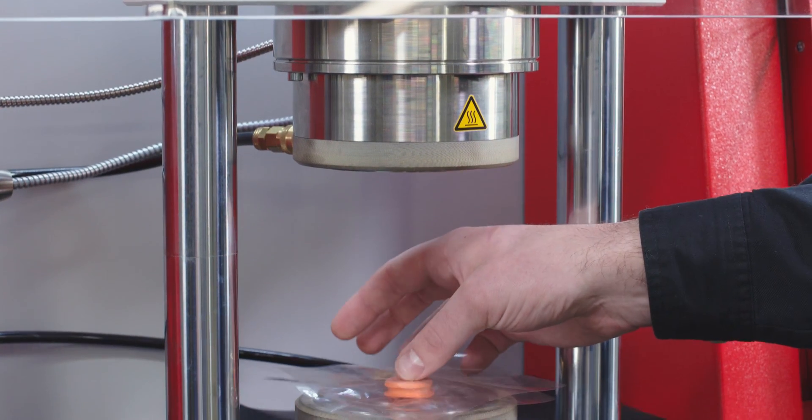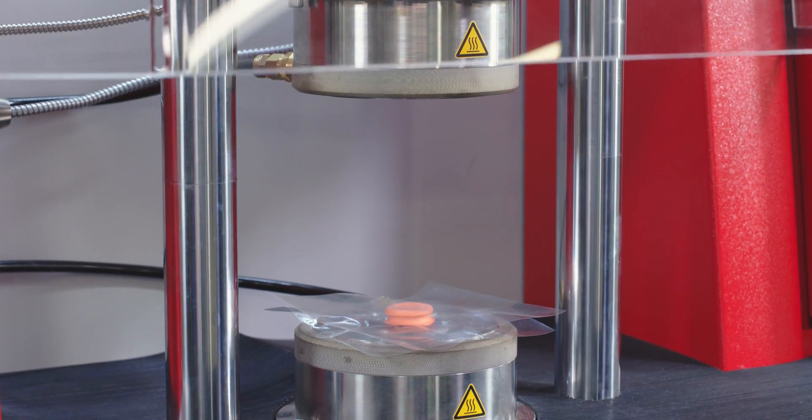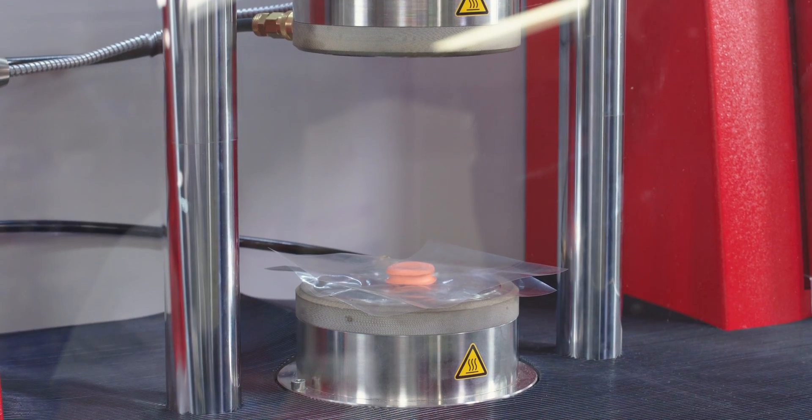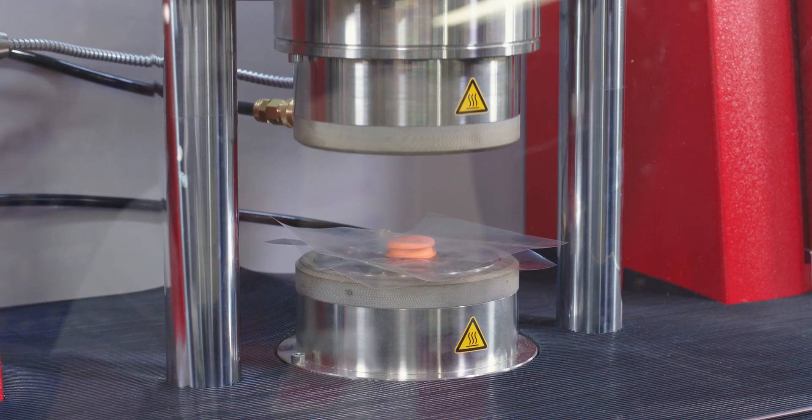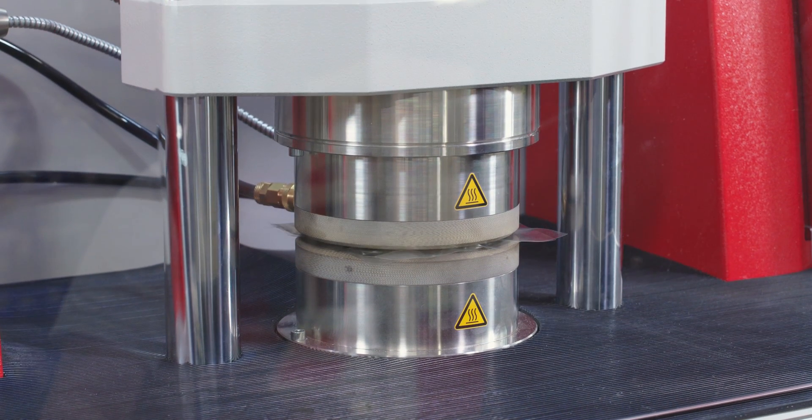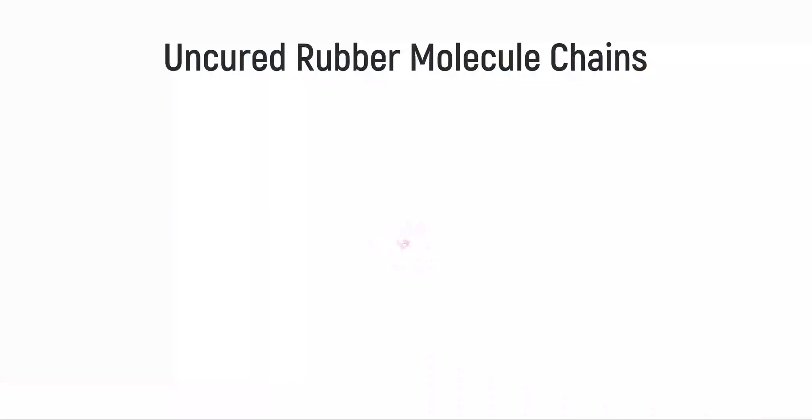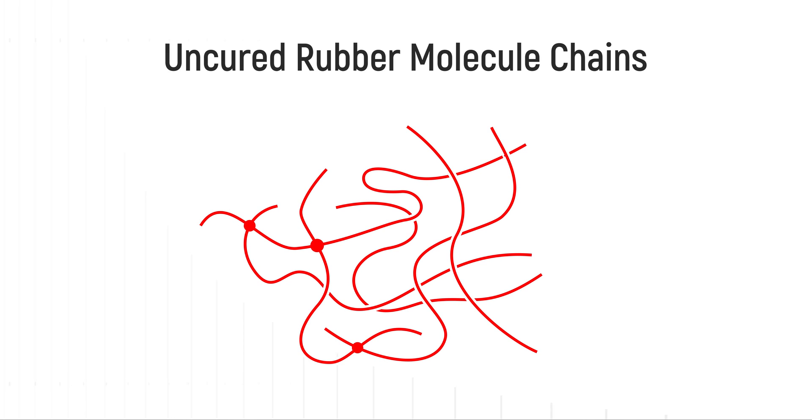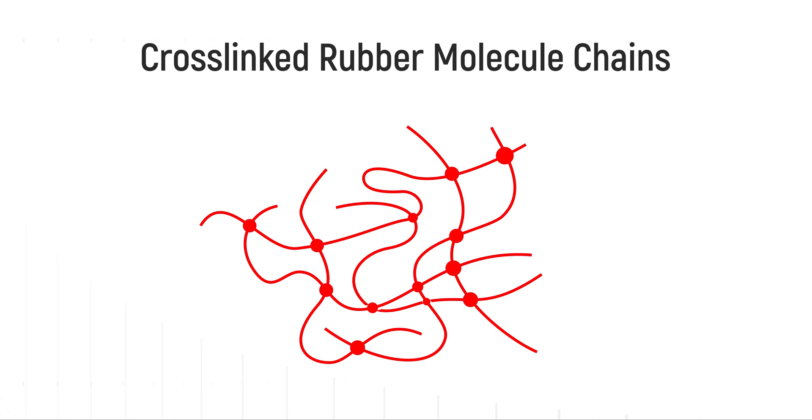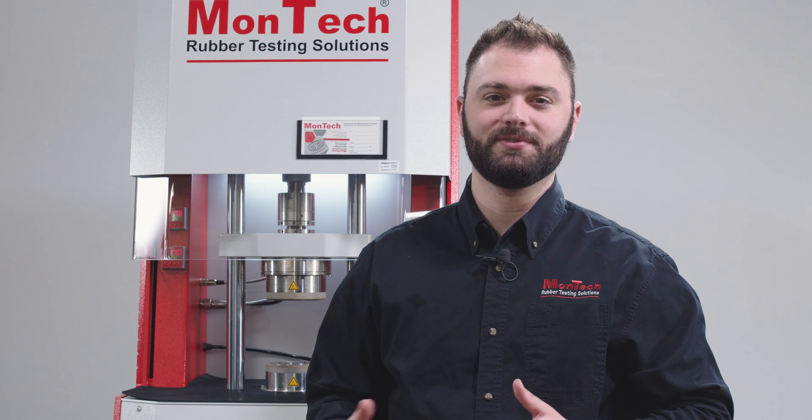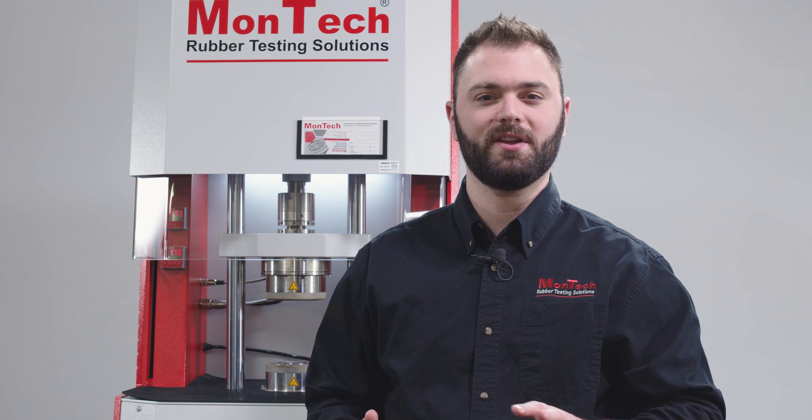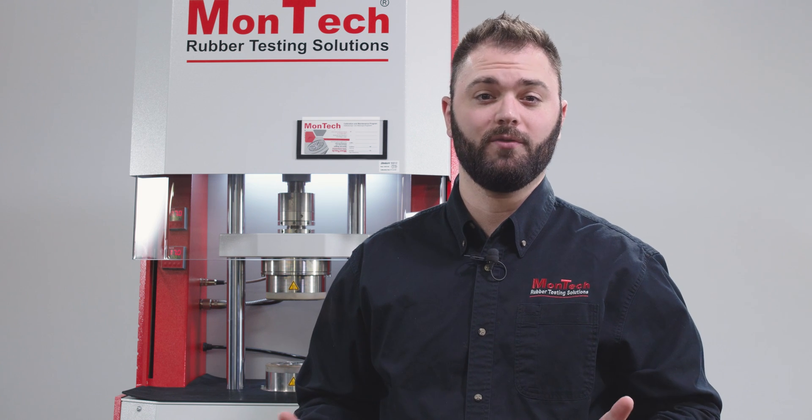MDR cure tests determine the cure characteristics of vulcanizable rubber compounds. During the test, an uncured sample is pressurized and heated in the sealed test chamber while being sheared by oscillation of the lower die. As the test progresses, rubber molecules within the sample form chemical bonds called cross-links, which bind the rubber molecules together. The cross-linked rubber molecules develop a net-like structure that reinforces the sample and increases its stiffness, also known as curing or vulcanization.